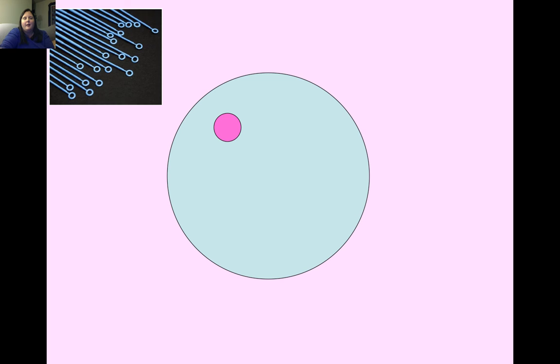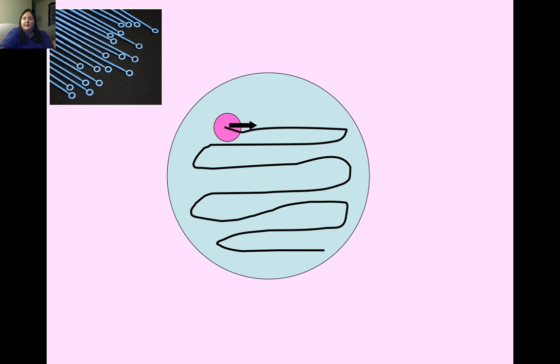When putting bacteria on the plate on day two, pipette a drop of your bacterial solution into a corner of your petri dish. Use a loop — barely touch, don't poke or gouge — and zigzag it through to spread the bacteria. Then do that in a second direction to help spread it out a little more.